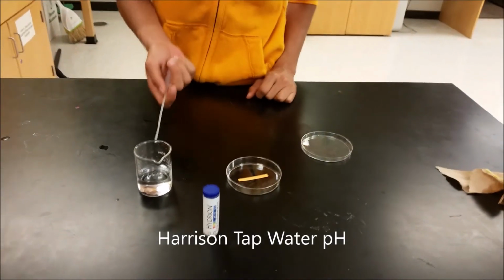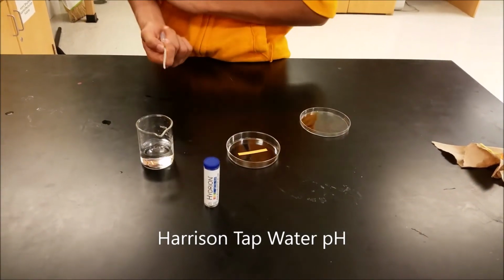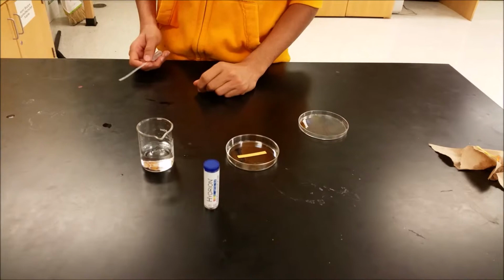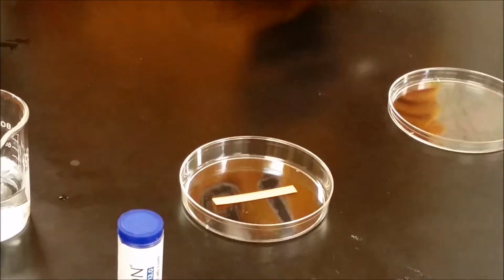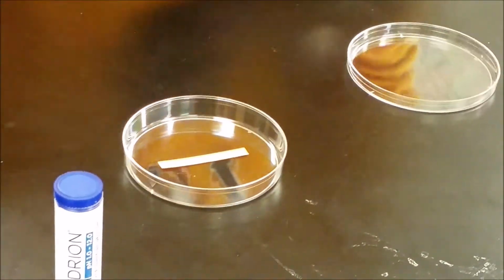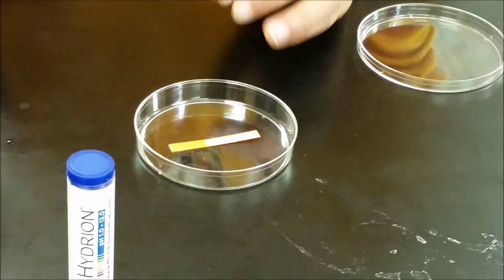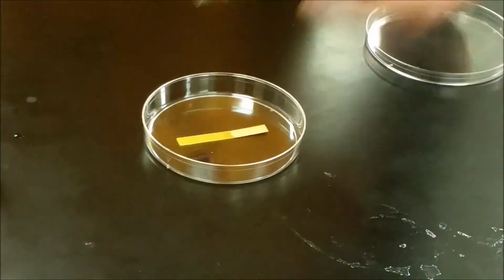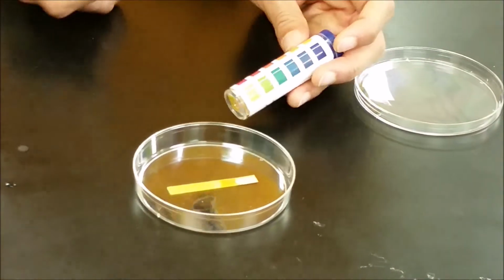Okay, so here we have another 40 milliliters of water. This time it's again from Harrison. However, it's from one of the faucets in the chemistry classroom, and we're going to again test its pH. Okay, that's good. It looks like it's about a 7 again.